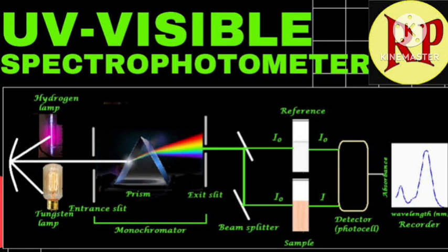Actually, this experiment can be done without solvent, and a result will come but with some errors. To rectify those errors we need to use solvent. When we use solvent there may be some impurities in it, but we can adjust the detection and finally we get the best values and the graph. The detector will collect the light and convert it into electrical signals, and it is shown as a graph by the recorder. And this is the experiment.